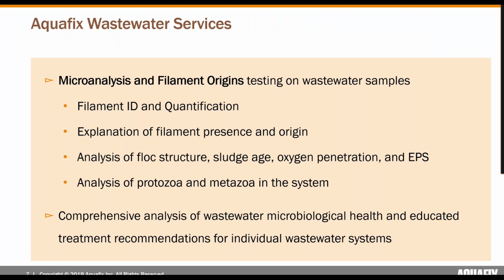In regard to microbiological analysis, Aquafix is able to provide laboratory testing for wastewater samples. Our microanalysis and filament origins testing is primarily focused on filament ID and quantification, explanation of filament presence and its origin, so really what's causing these filaments to grow, analysis of floc structure, oxygen penetration, and EPS levels, which we'll discuss further later, as well as an analysis of protozoa and metazoa within the system. And this all kind of leads us to an overall sludge age and overall health for a particular wastewater treatment system.